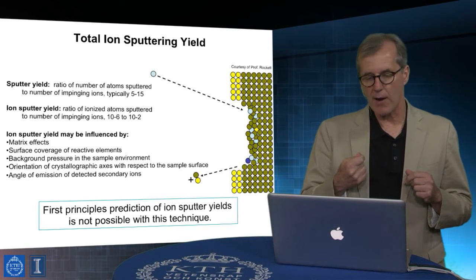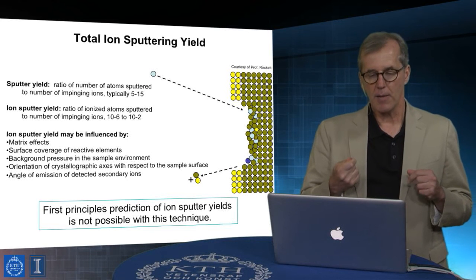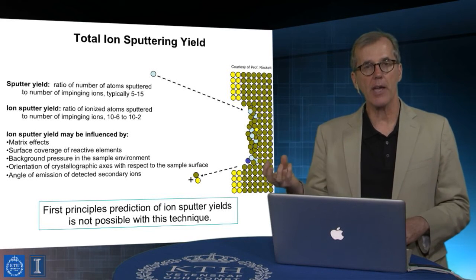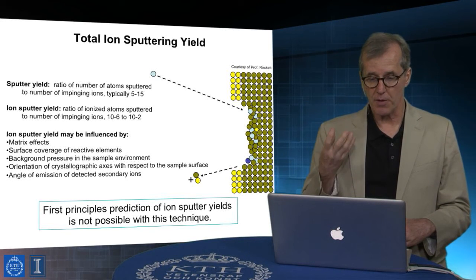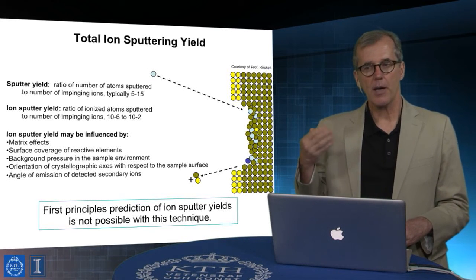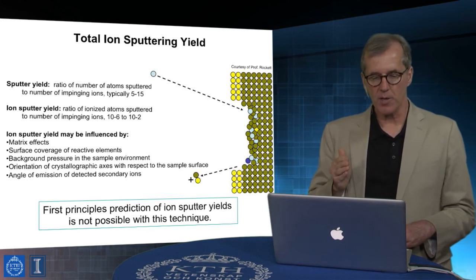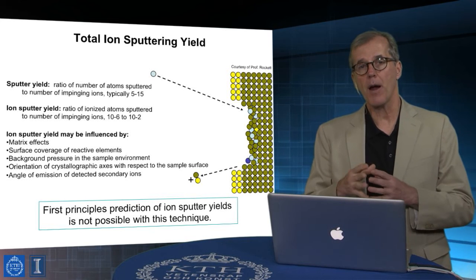Ion yields will vary with what are called matrix effects. That is how the surrounding host of atoms influences the creation of an ion, which is then expelled from a sample surface and finally detected. That's an important attribute. Part of it is an interesting feature. Some materials actively segregate components at their free surfaces, right? So these surface segregation effects could be an important property of a sample.